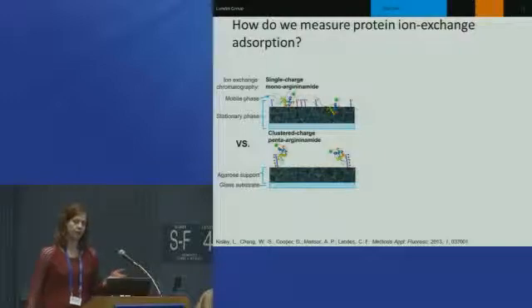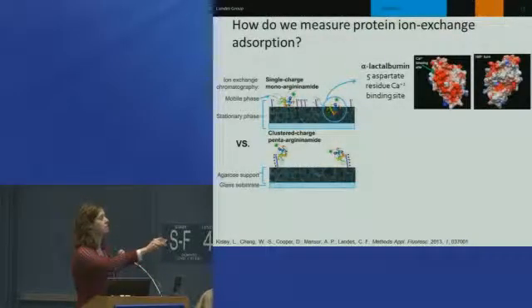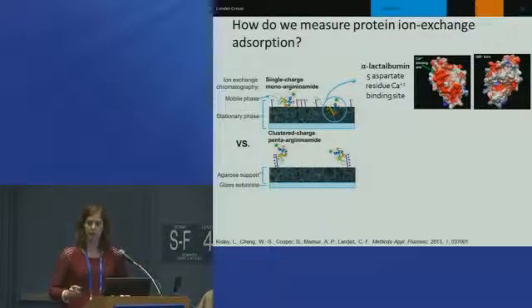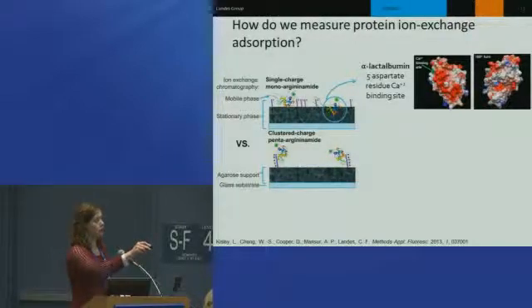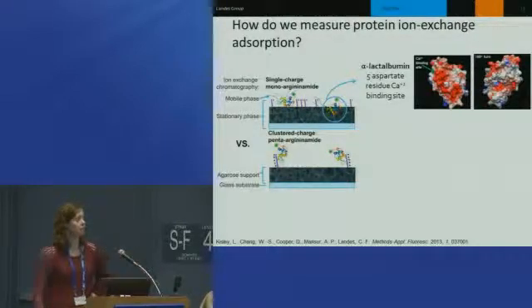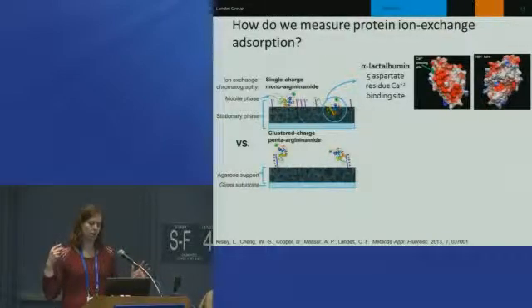And then that's going to be decorated with common ion exchange ligands, either single isolated ligands, as are used commercially, or, to test our clustering hypothesis, we're going to actually engineer clusters of our peptides by making chemically a polypeptide so we can control the cluster size and position. We don't allow it to happen accidentally. And then our model analyte is going to be a globular protein, alpha-lactalbumin, so that we can avoid any funny business with respect to the protein size and shape in terms of its transport.